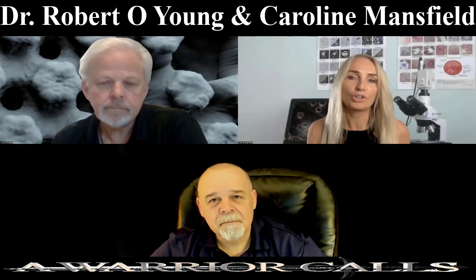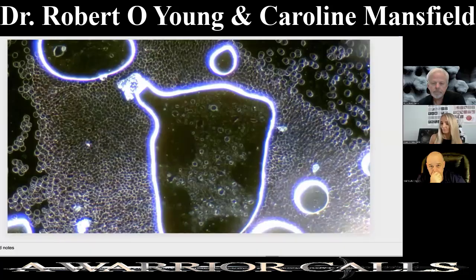So I want to show what product looks like under the microscope for Darkfield microscopy, so people can get an idea that when people are looking at things and making assumptions, it's not necessarily correct, because we can see all sorts of wonderful sparkling moving patterns using Darkfield microscopy. So that's what I just wanted to share with everyone today. So let me just share the screen.